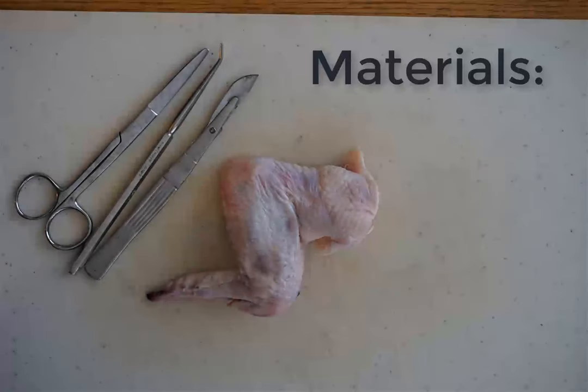Welcome to our first muscular system lab. Today's materials are a chicken wing and dissection tools including possibly a scalpel, a probe, and definitely some scissors.